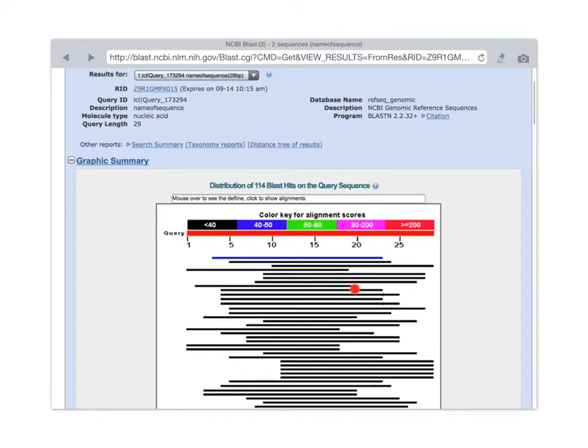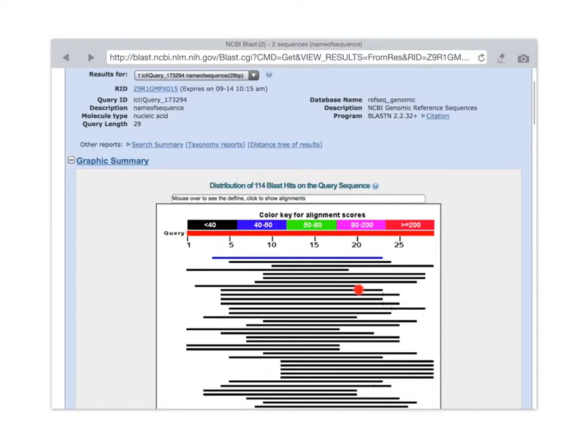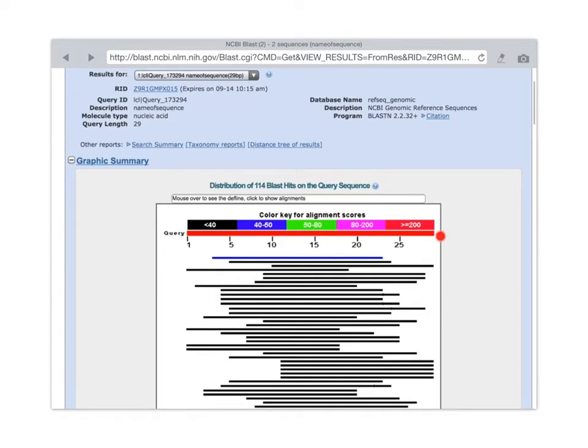So for example, this black line matches probably from about nucleotide 2 to about nucleotide 20 of our query sequence. And the colors of the lines represent the score, or how well our query sequence matched a subject sequence, that is, a sequence that's in the database. So usually you want to look for scores that are greater than 200. That means really high quality or good matches.